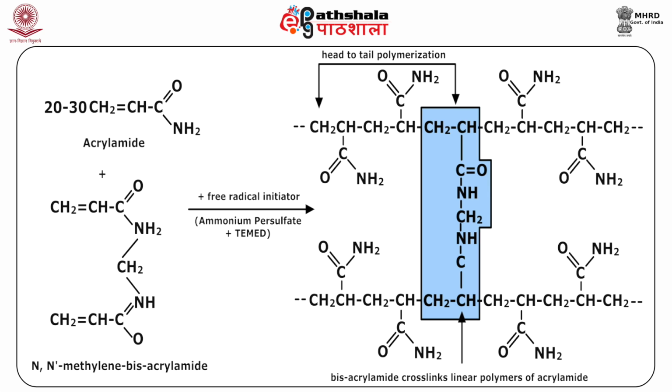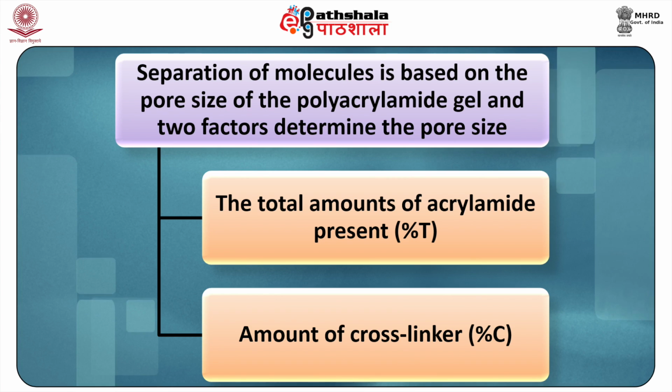These gels are hydrophilic in nature, neutral, and are formed of long chains of hydrocarbons cross-linked by methylene groups and having a 3D network. Here in this reaction, we have shown the structure of acrylamide monomers and the polymerization process. In this diagram, the acrylamide monomers cross-link to form branched or cross-linked polymers.